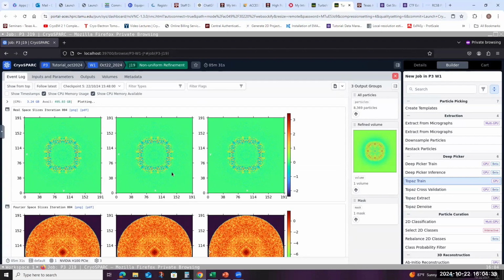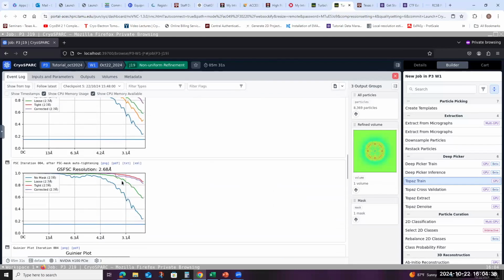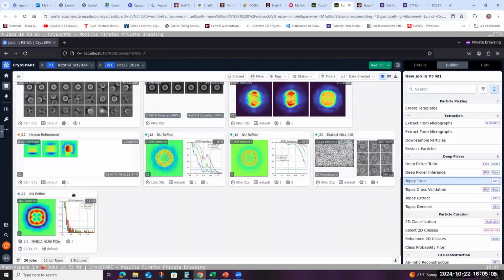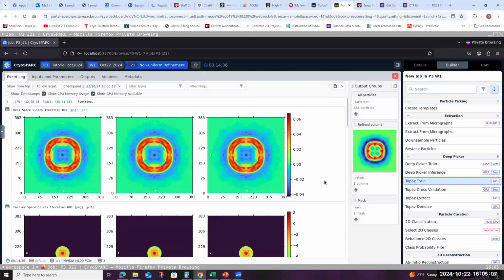You might see the resolution improve to 2.5 angstrom or 2.4 angstrom, but largely it's going to improve the look of the FSC curve, because now at the lower pixel size the cutoff will be somewhere around 0.6. So the 0.6 means this plot can be extended better and have the noise level somewhere here. That's the only thing going to change. Other than that, not going to change much. So if you want, you can end the tutorial, or if you want to wait.